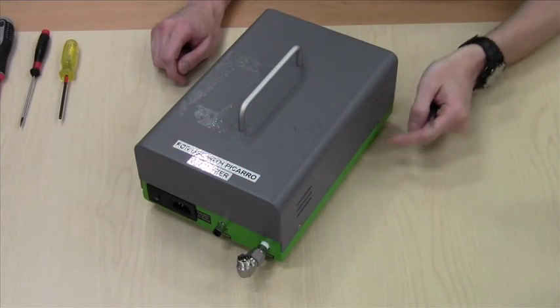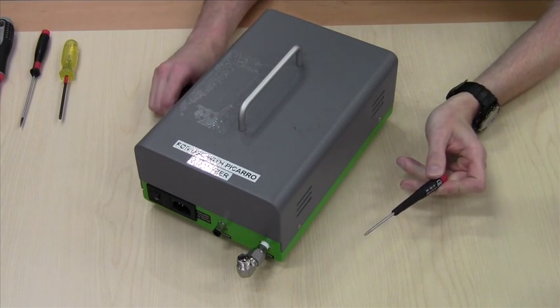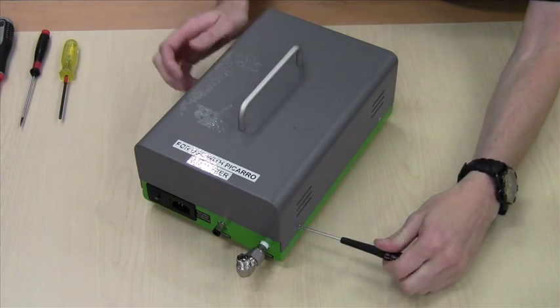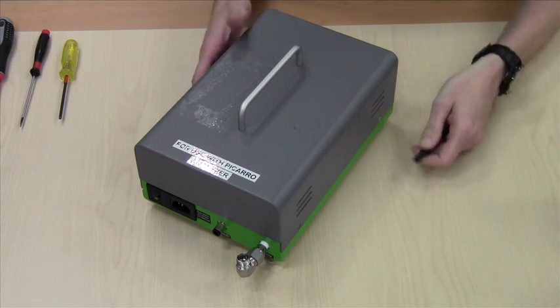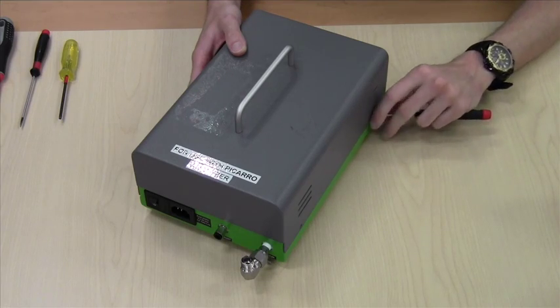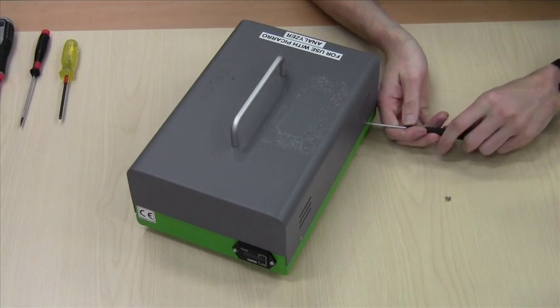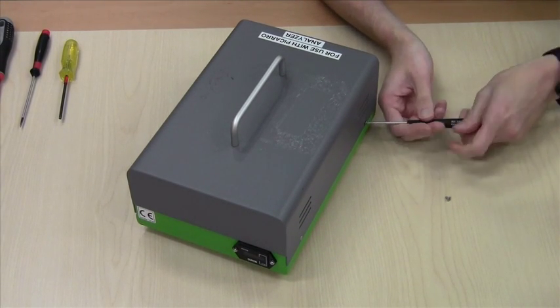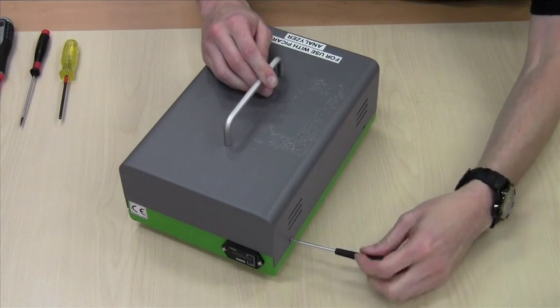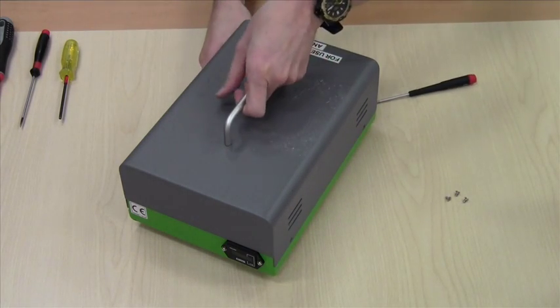Begin by removing the four cover screws using a number two ball driver or Allen wrench. The cover simply lifts off.